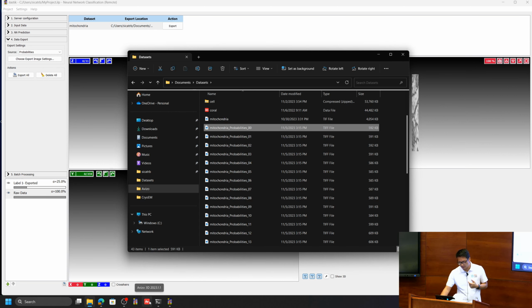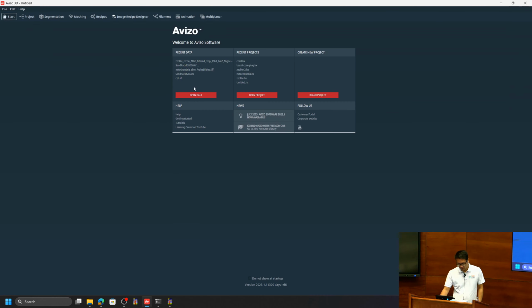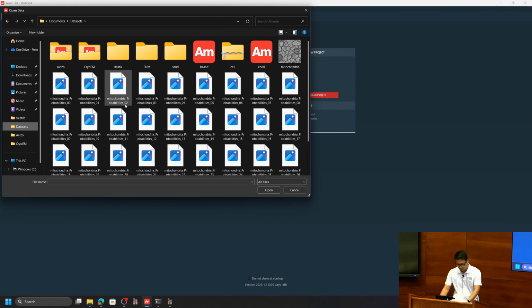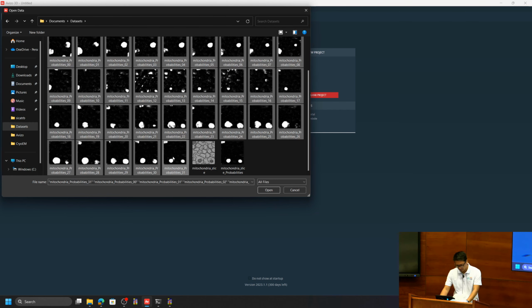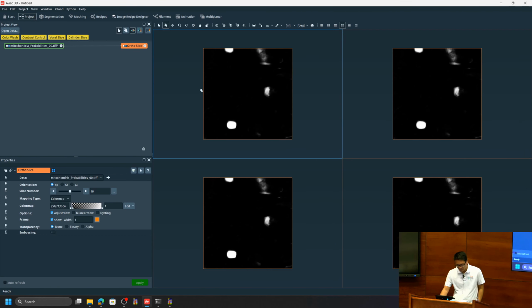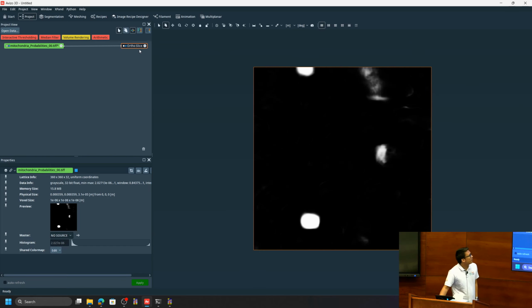So let's start Avizo. Now I'm going to open data. All right. So this is how it looks like.